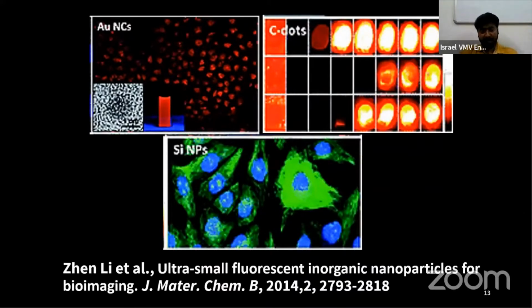And your material should have a good contrast against the background of the normal fluorescence. You call that background fluorescence, and the material should absorb in the near infrared region. In the red region, let me say, the red has different tinges of color, and you find these gold nanocrystals having red color absorption, and that is showing such a bright color emission in the cells, and you find good contrast. What is the application of that?